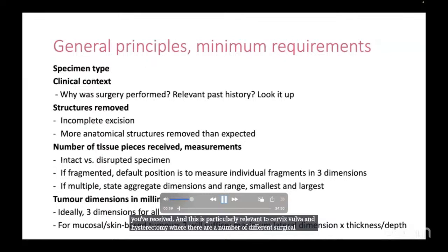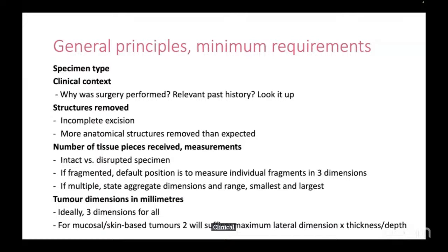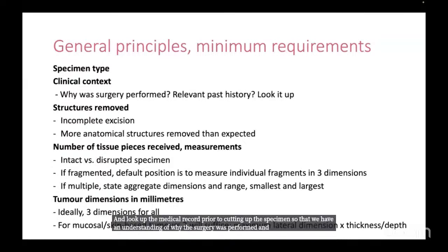And of course, this is determined by the surgeon. Clinical notes are vital. Often we receive specimens without a detailed clinical history, and I think we really should stop and look up the medical record prior to cutting up the specimen so that we have an understanding of why the surgery was performed and what the expected pathology is.